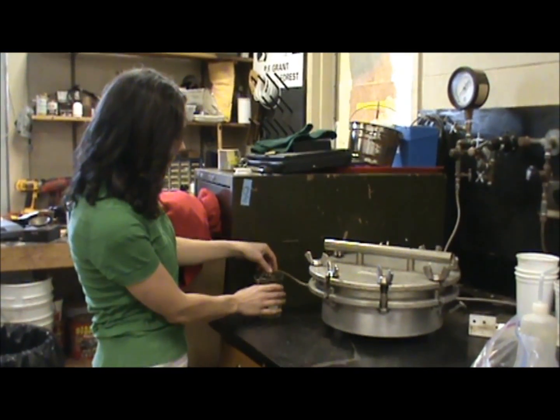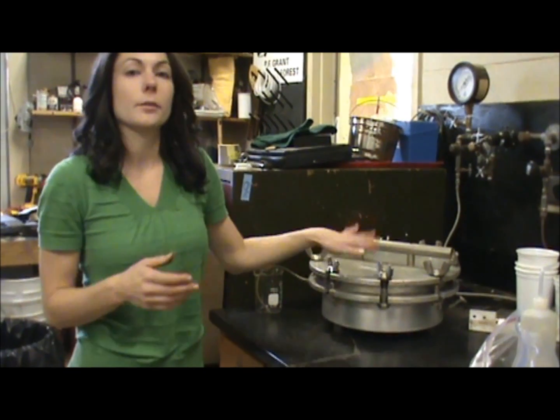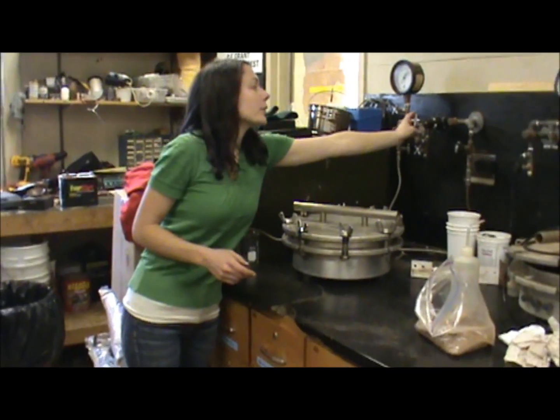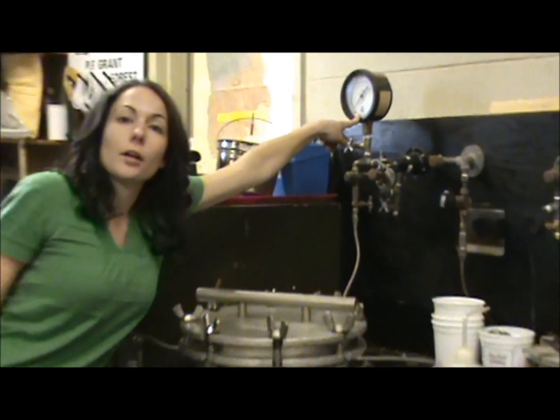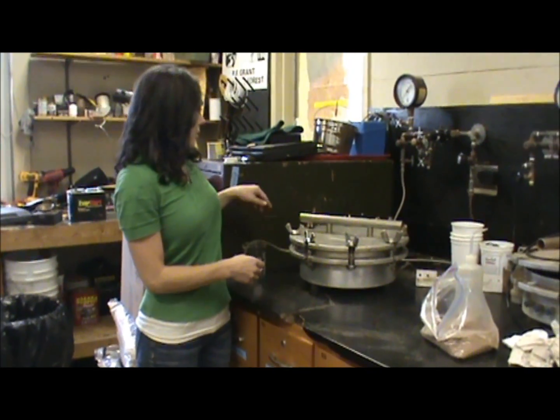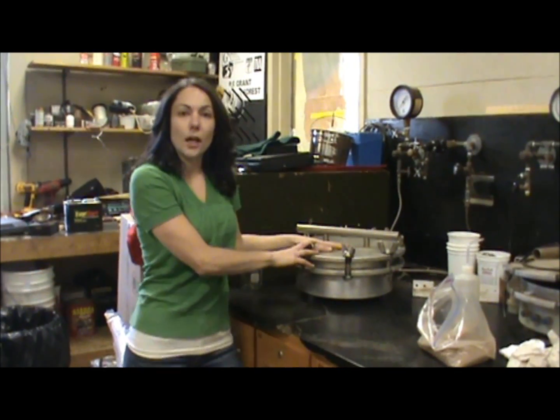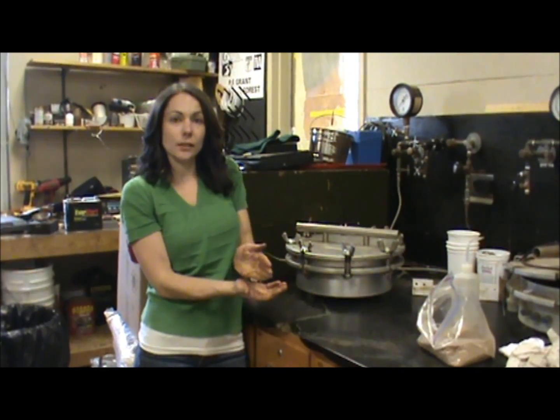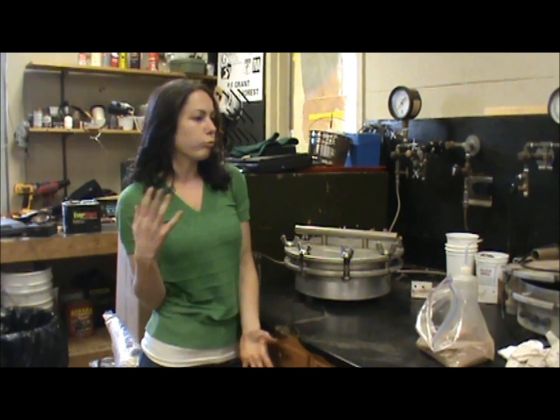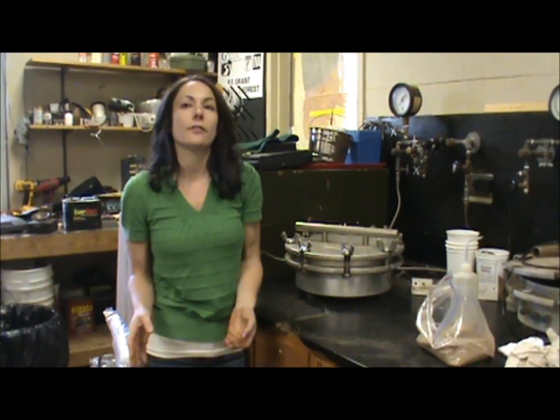I'm going to put a beaker here to collect the water that's going to be pushed out, and then we have it connected here. All we do is turn this on and turn the pressure up to 15 bars. We let it sit for about three days, and then once that's done, we open these up, take the rings off, empty the soil into an aluminum pan, weigh it, put it in the oven overnight, and then weigh it again to get the water content at 15 bars.